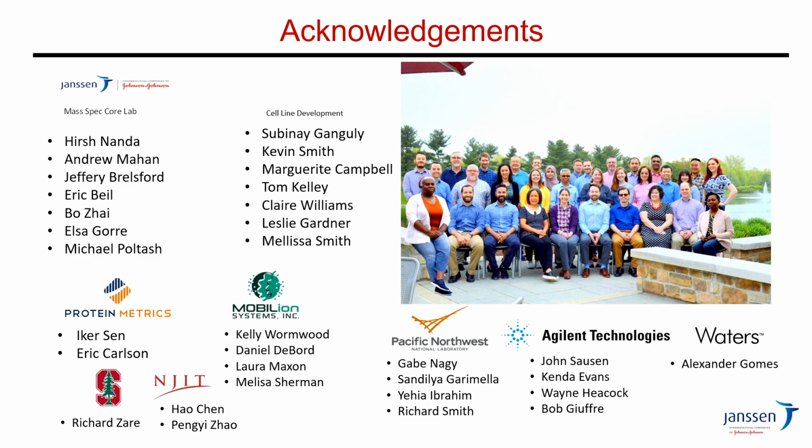We're also looking into that along with these academic partners, because this was the first time we did an enzymatic reaction. So Graham and Dick, they are focused mainly on examining organic reactions and accelerating, improving the reaction efficiencies of difficult organic synthetic routes. It's never been done on an antibody or on an enzymatic kind of reaction. So this is the first. And we still are trying to figure out some of the parameters to improve the efficiencies.